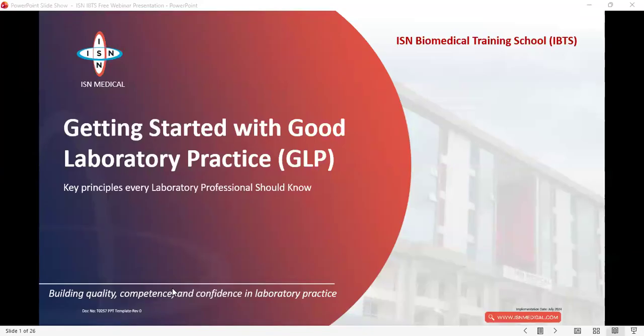So people began to wonder what actually is the problem. But in the end, we checked the expiry date and discovered that this particular kit had expired. So if something is expired, it's going to give wrong results. Although someone has already said that it can give both good and bad, my own view is that if the sample or anything they're working with is wrong, it's going to give a bad result. I don't know if there's a concrete reason that when you put in something good, it can actually get a good result.